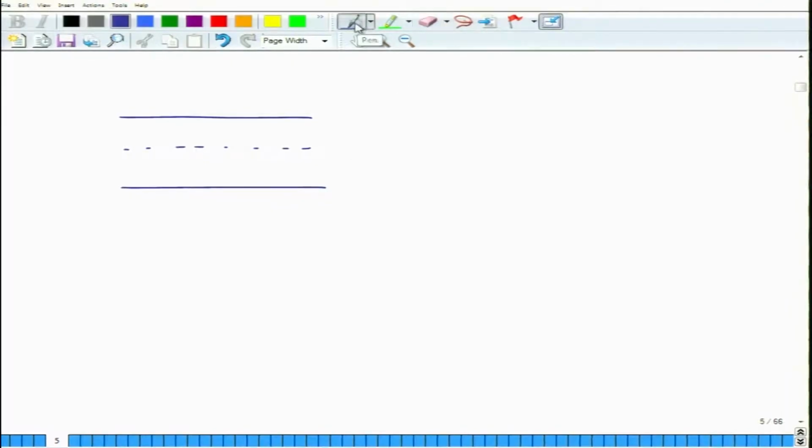So, if you say that this is 100 and this is 100, then the middle of it will be 200, then you can also define this as 200. Okay. So, let us not talk about 200 at all, let us just talk about the 100. Now, if you have incoming beam in this fashion, let me use a different color, this is incoming beam, this is outgoing beam.